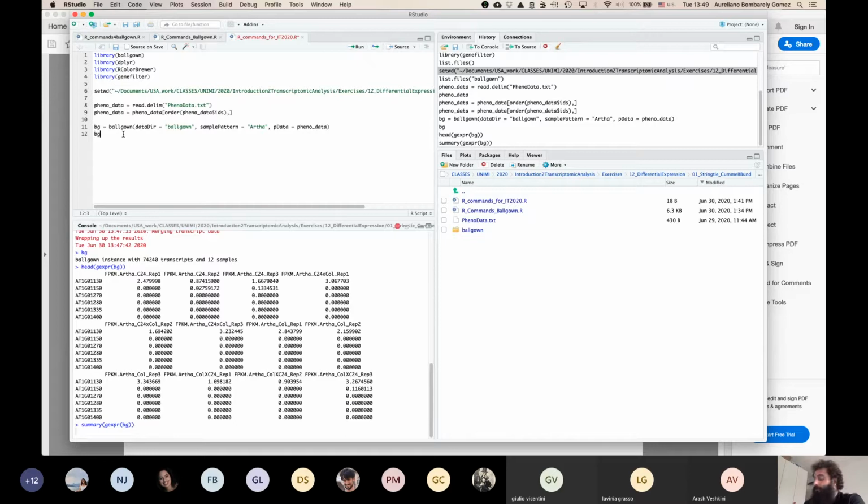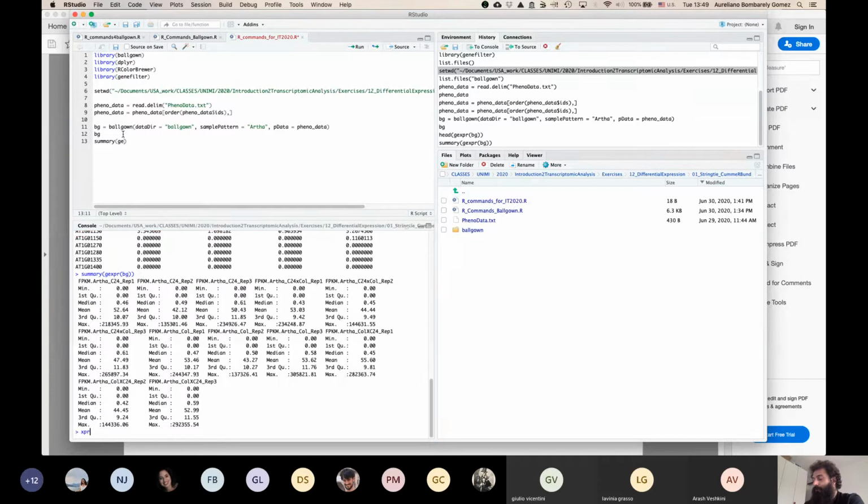So this, and then summary of expression. Oh, sorry. Well, indeed, I don't need to do this. I can always go here and move. Okay. So with summary, it's going to give you some stats.